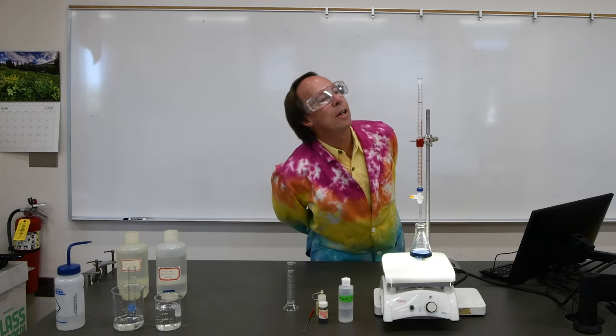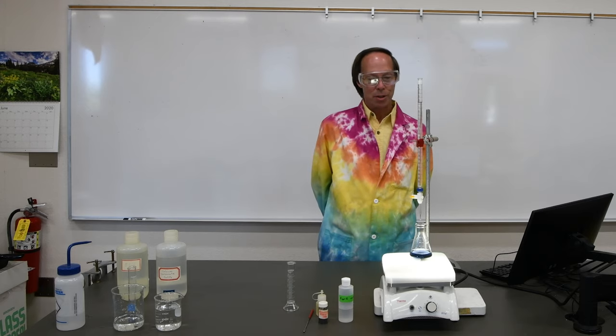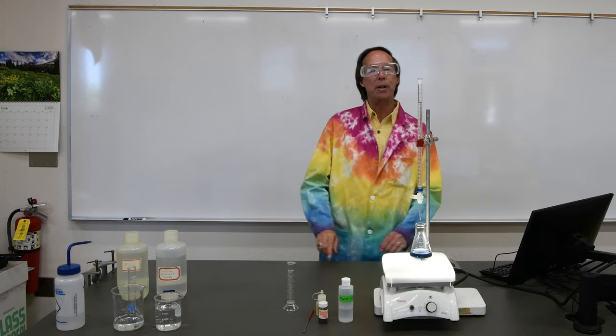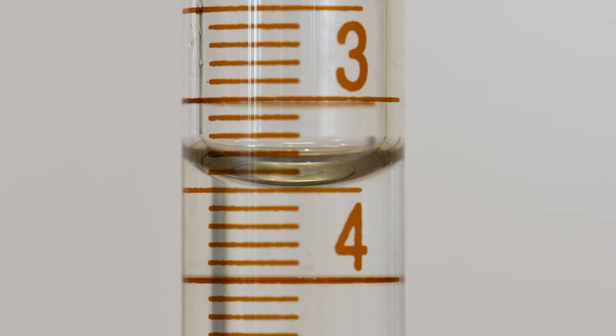And it did indeed take a bit less. It looks like it's maybe just over 1.5 milliliters at this point. We'll take a more accurate reading of that in just a moment. This is the final burette reading for this trial, and we'll also use this as the initial burette reading for our next and final trial.